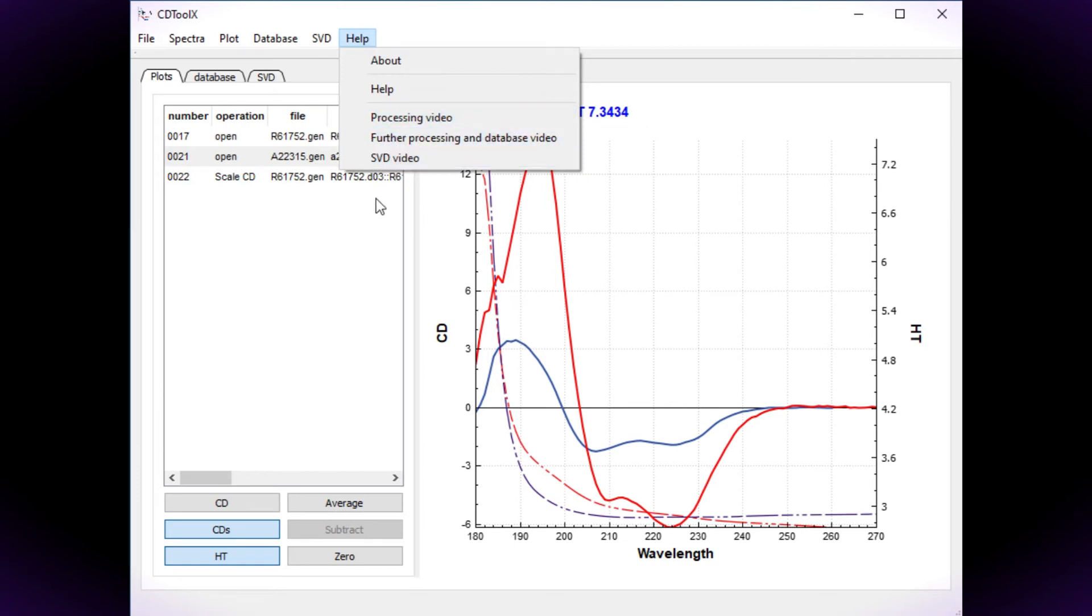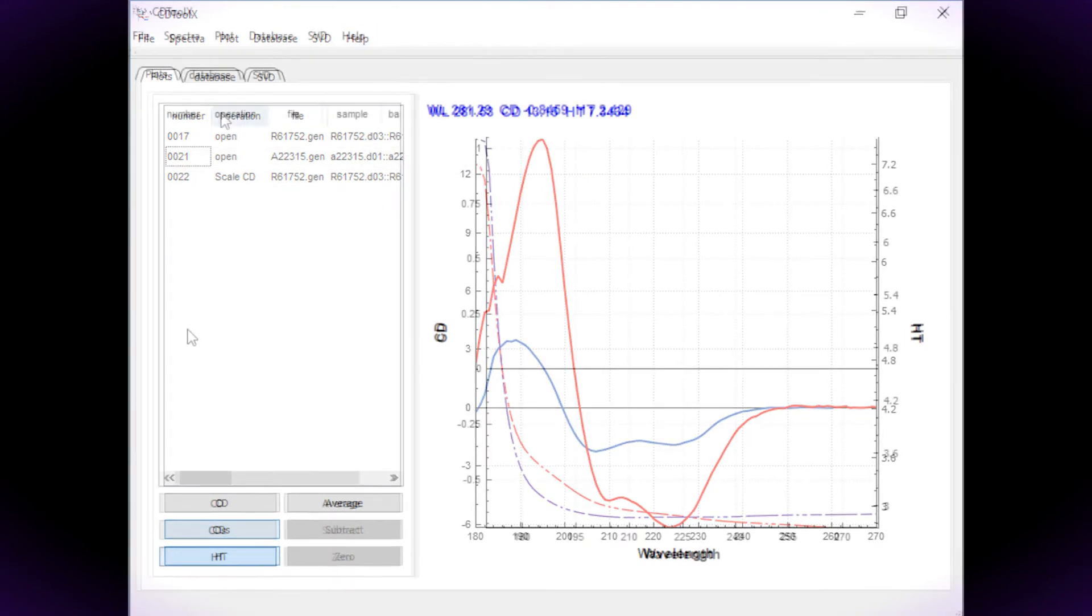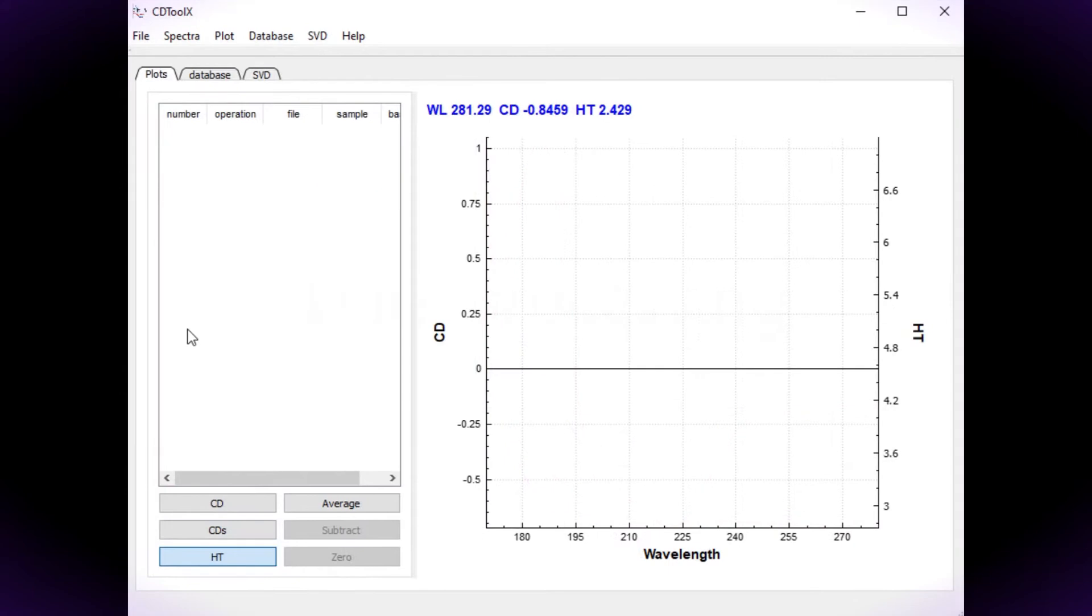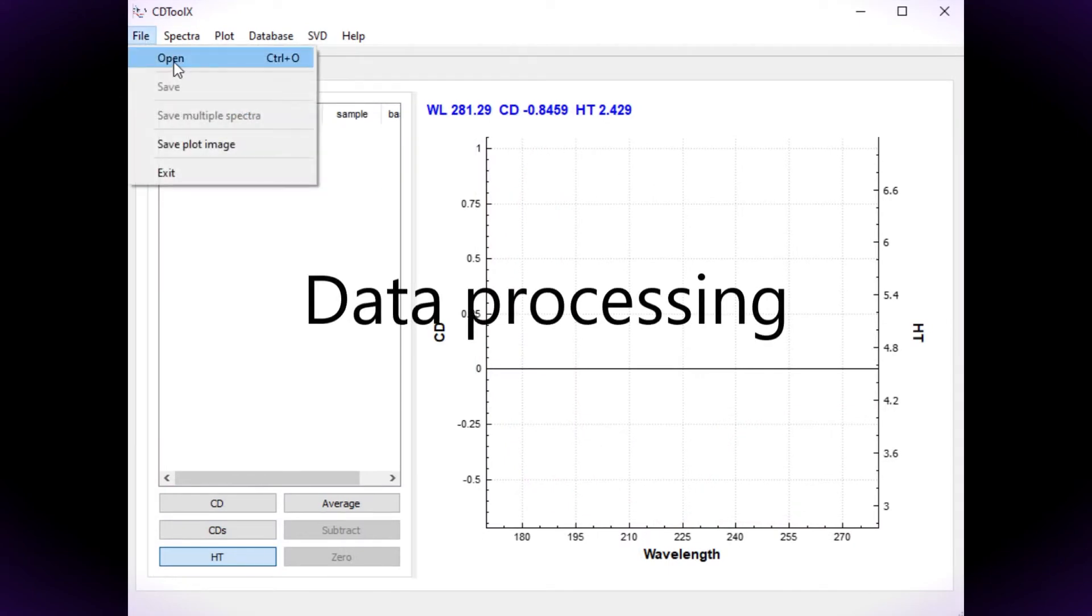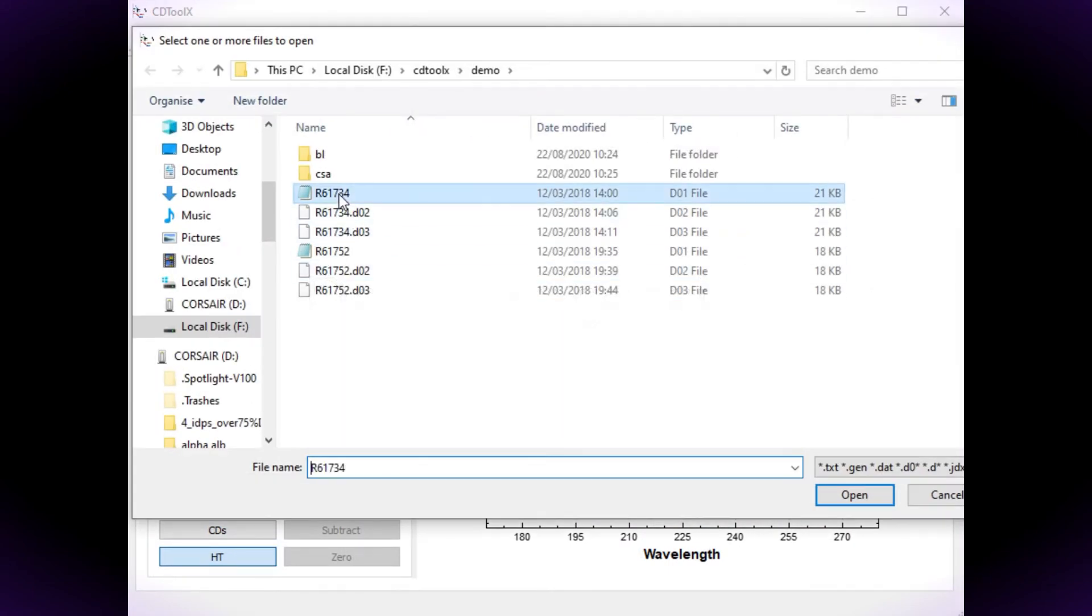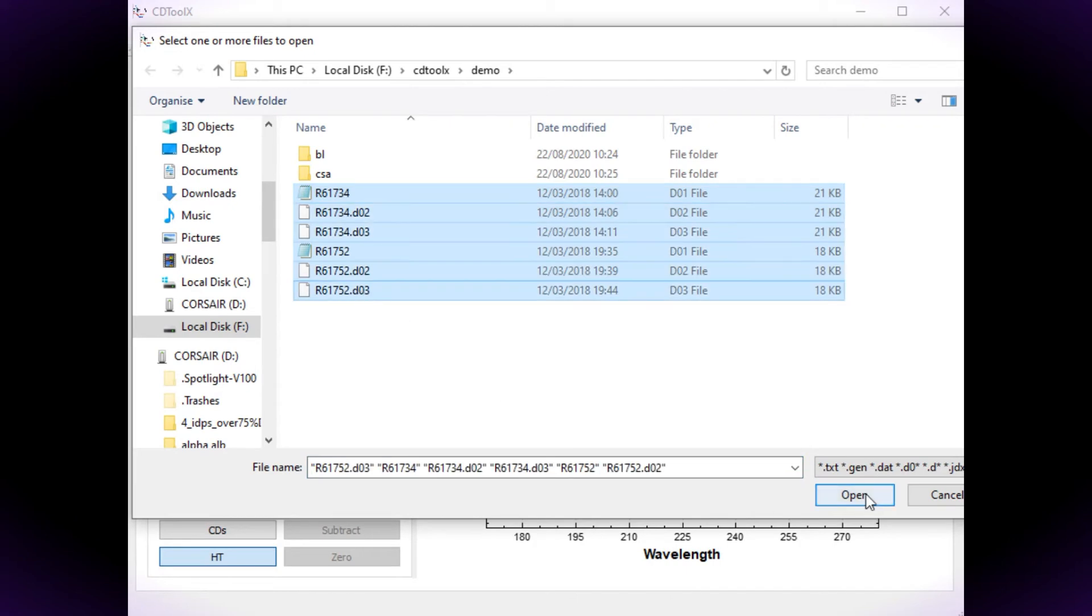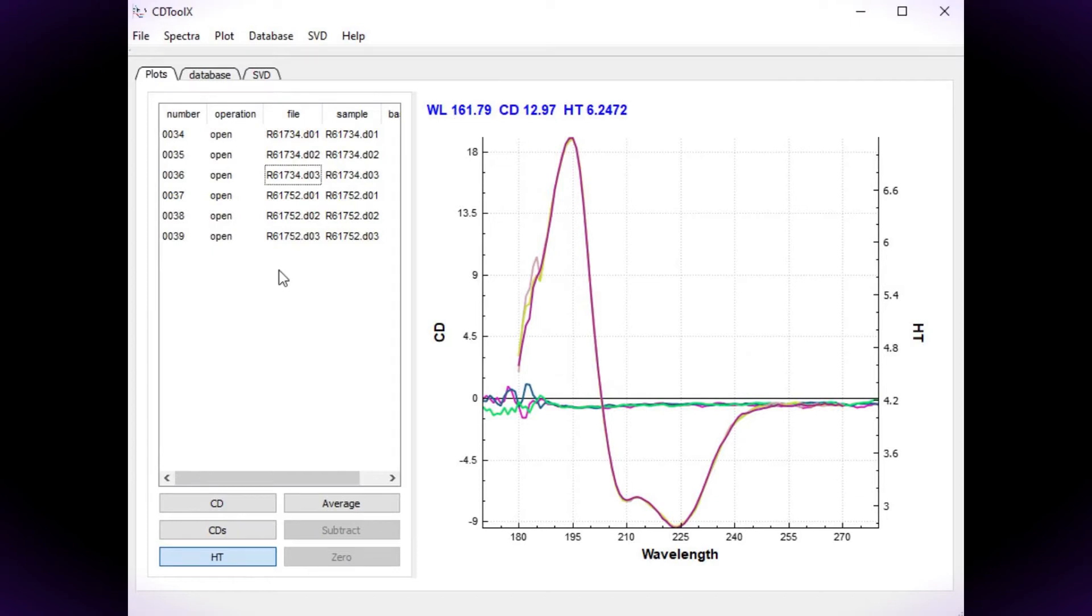In this video I'll demonstrate how to process data. Navigate to the raw data files and select them. I've selected three repeats of the sample data and three repeats of the baseline data.